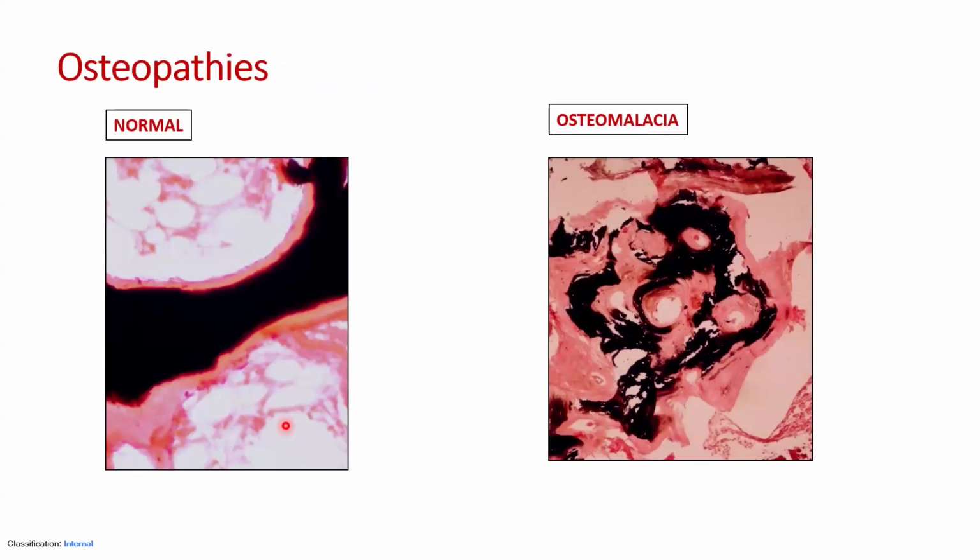So this is a normal undecalcified section. You cannot do your regular decalcification because this can alter the pathology that is seen. So they are embedded in plastic embedding media like methyl methacrylate, and then the bone is put in methyl methacrylate, which is a liquid, and once it is kept overnight, it hardens. In the morning, these need heavy duty microtomes, so they cannot be used on the regular microtome.